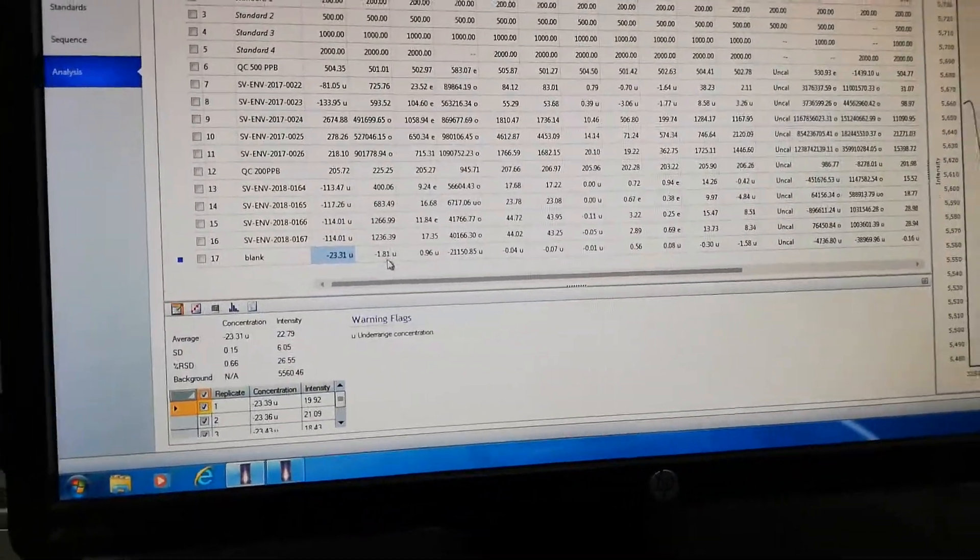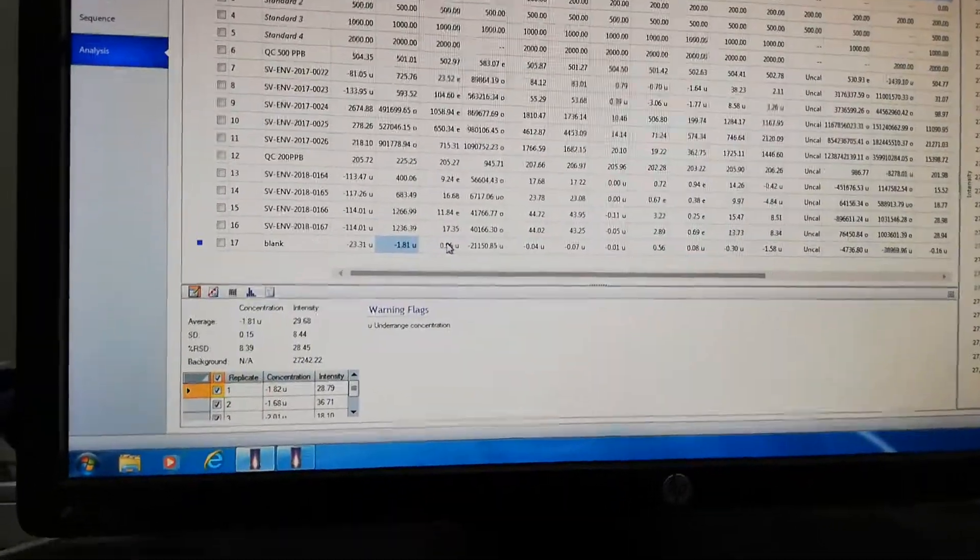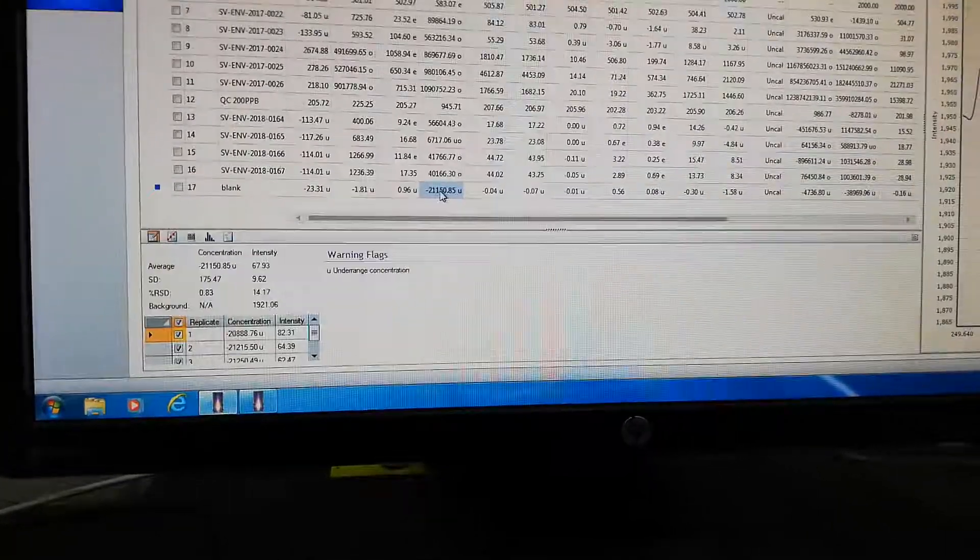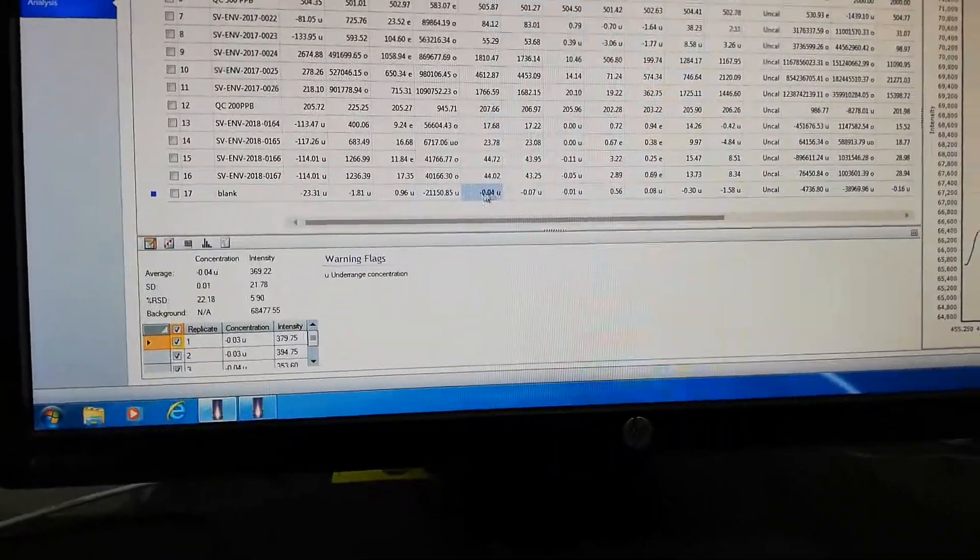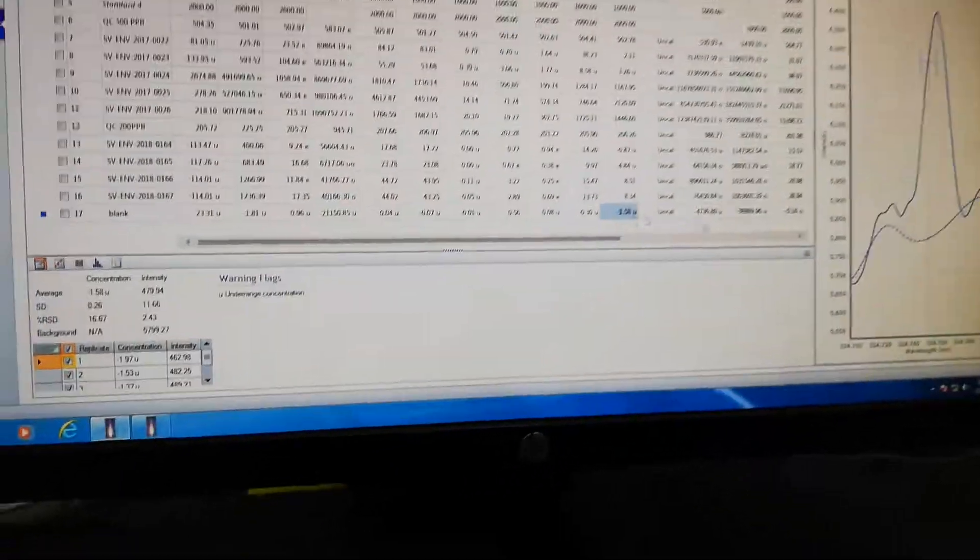Here you can see the intensity for each metal: aluminium, boron, barium—all visible here.